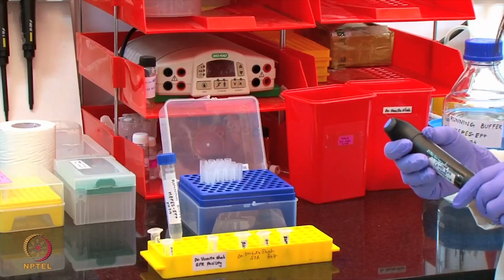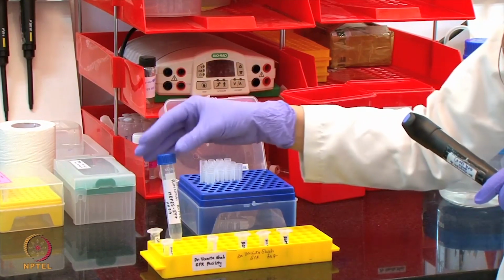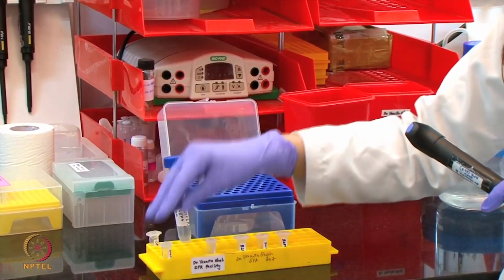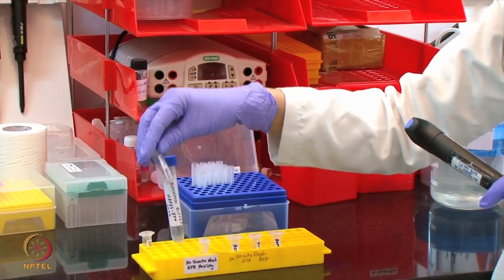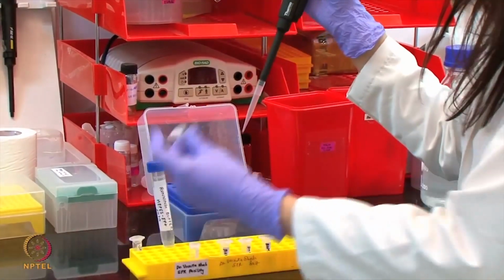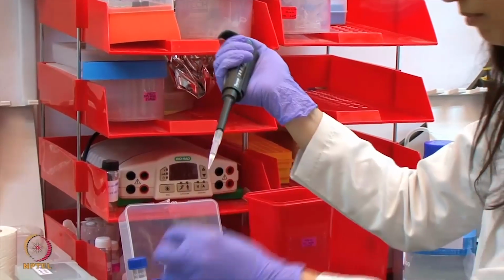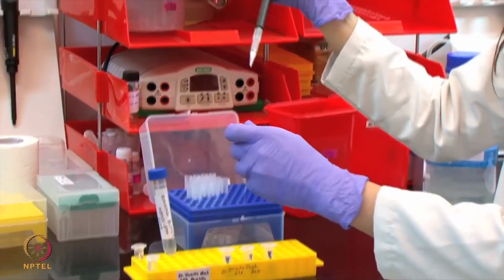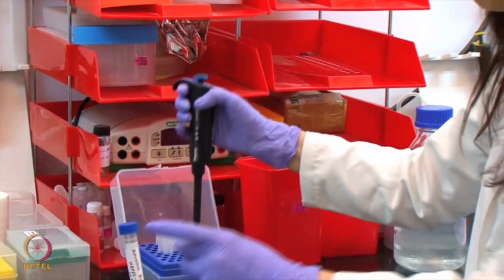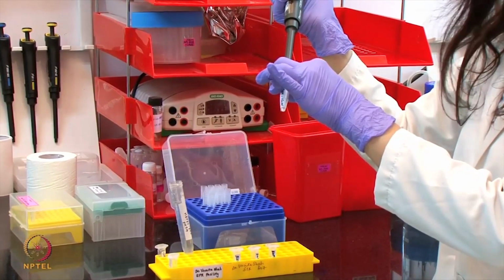We will be preparing this concentration series in 2-fold dilution using the running buffer, starting from the 32 nanomolar solution, which means we will add 300 microliter of 32 nanomolar concentration with 300 microliter of buffer to prepare 16 nanomolar concentration.